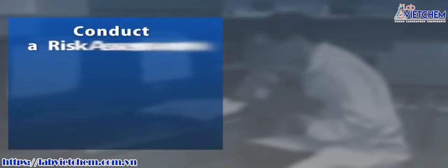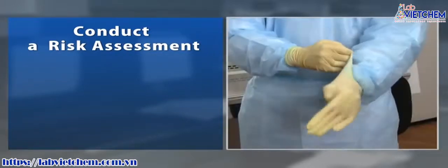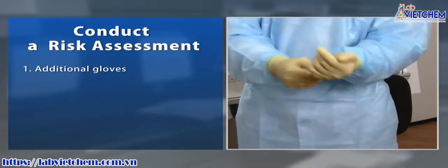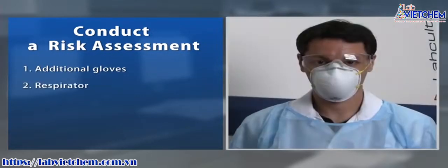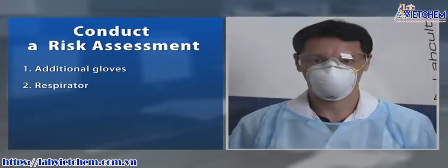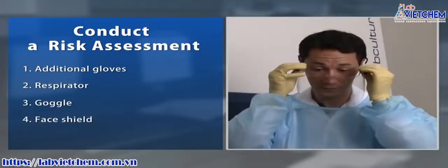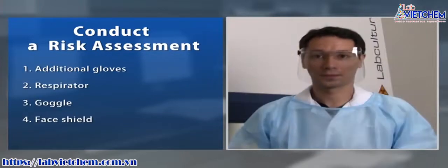Depending on the work being conducted, the risk assessment, and your laboratory standard operating procedure, you should wear appropriate personal protective equipment, such as additional gloves, respirator, goggles, or even a face shield for some of the higher risk work.